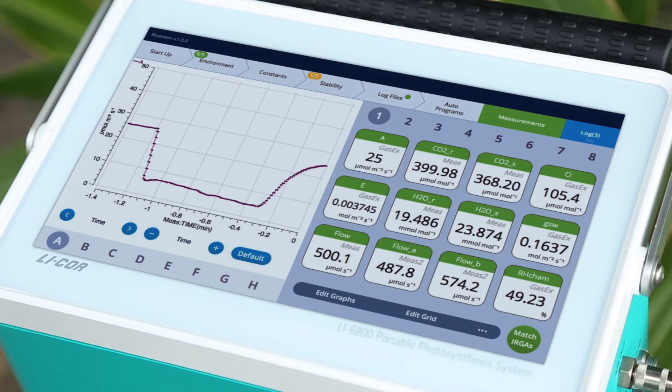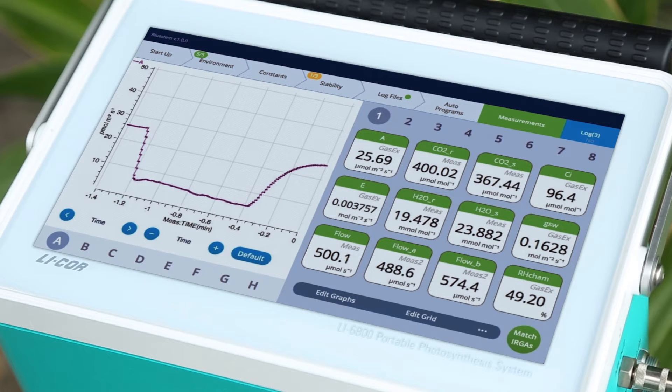The LI6800 is designed from scratch, incorporating modern technological advancements and knowledge gained over the past decades.